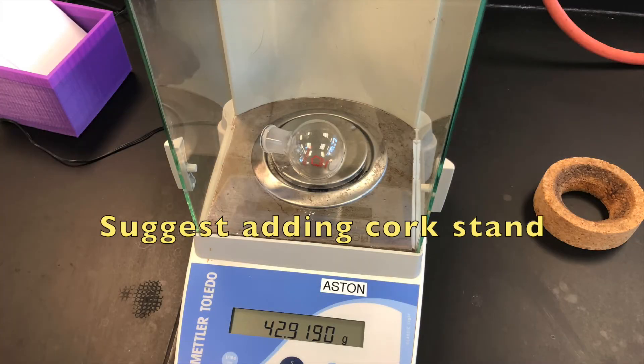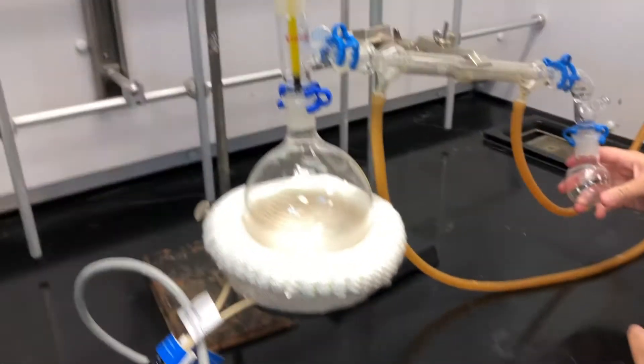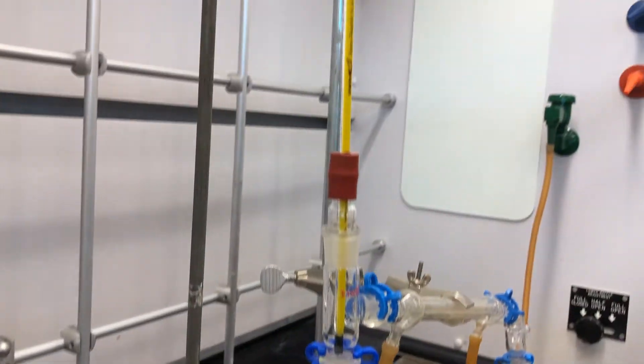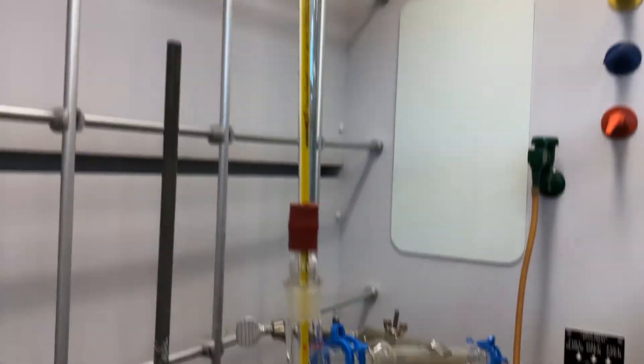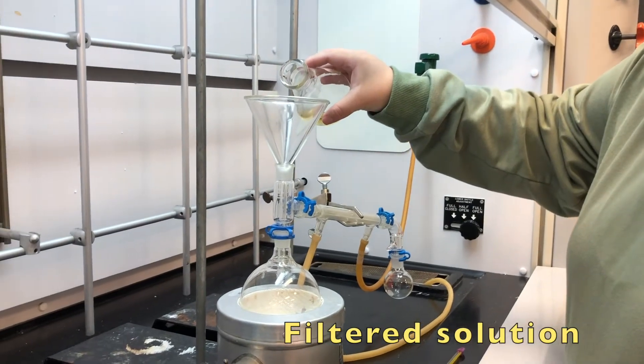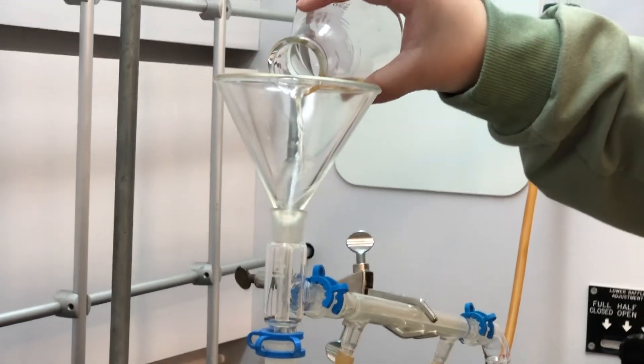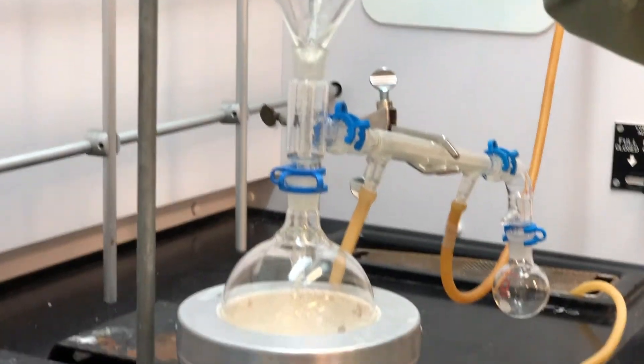Before setting up your distillation, weigh your tiny round bottom flask. To set up your distillation, obtain 4 keck clamps. Connect the bottom of the distillation adapter to the round bottom flask and the right side to the condensing column. To the right of the condensing column, clamp it to the vacuum adapter leading to the tiny round bottom flask. Before placing the thermometer adapter on top, place the filtered solution into the round bottom flask using a glass funnel.